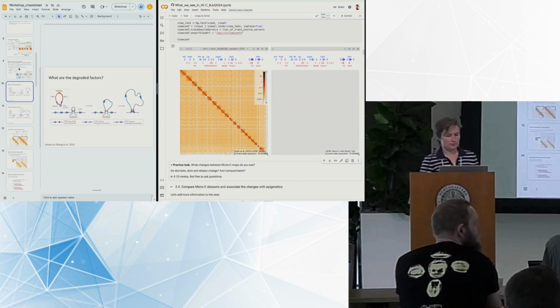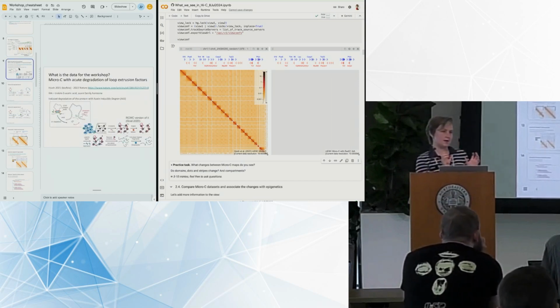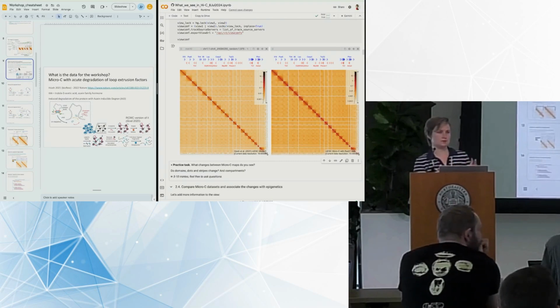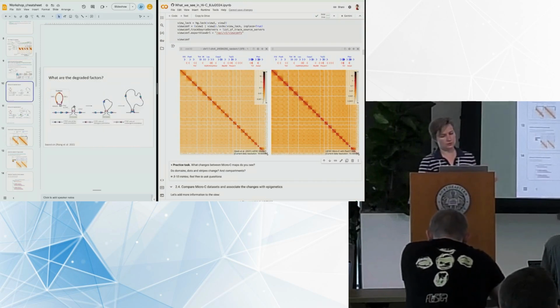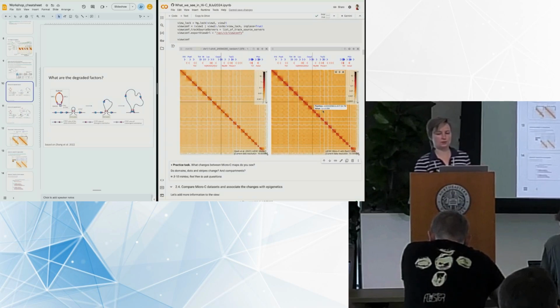So very briefly, we can add the genome tag for a protein of interest, in this particular case, element of cohesin, RAD21. And then upon treatment of auxin, we can fast degrade this protein. And we can take a look what absence of RAD21, key component of loop extrusion, how that will affect our HiC matrices. So from the first side, nothing specifically changes. So there are still chromosomes. We can still see enriched interactions within chromosomes and far less interactions between chromosomes. But let's try to zoom in some particular chromosome.